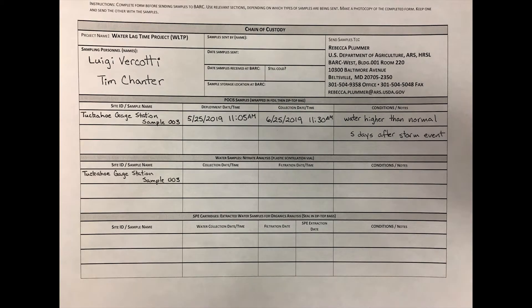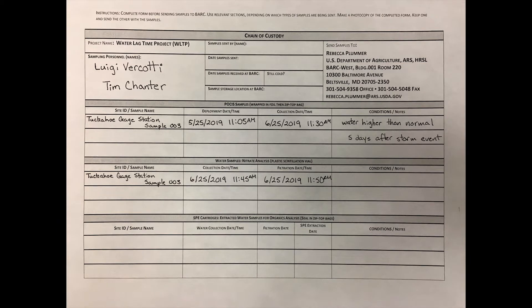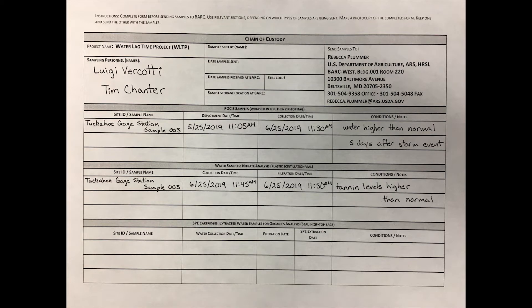For the water sample, write the site ID and sample name, and the collection date and time. Also fill in the information for the filtering date and time, and notes such as tannin levels or sediment load.